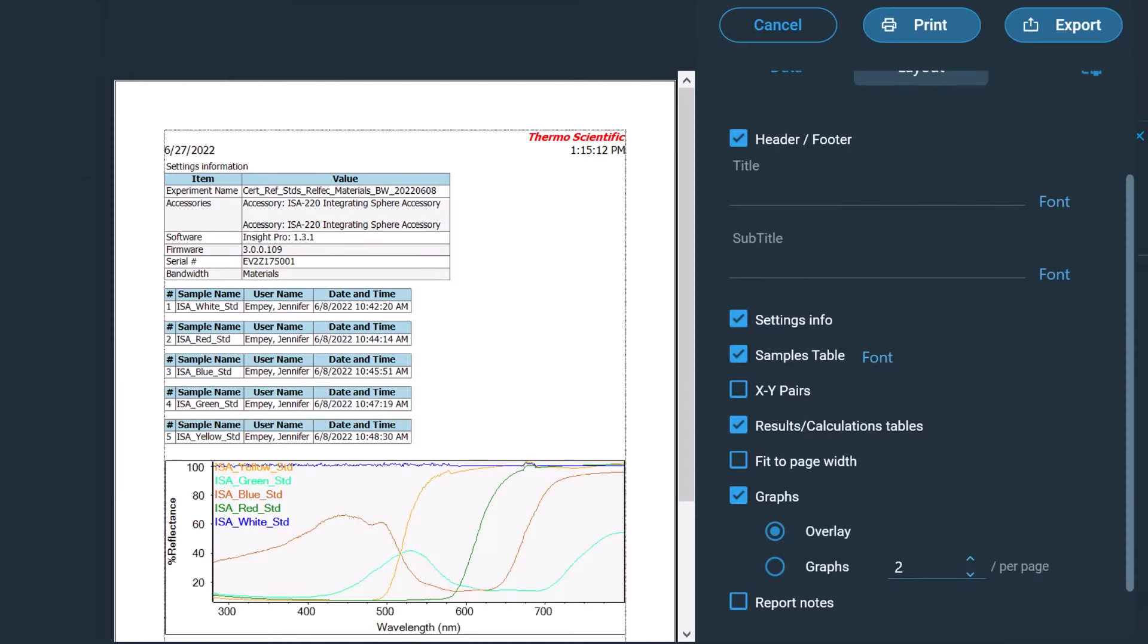A data report can be generated including the data, graphs, instrument settings, user, and calculations performed using the instrument software. The measured data and report can also be exported manually using the same file format as described earlier and read in the appropriate program.